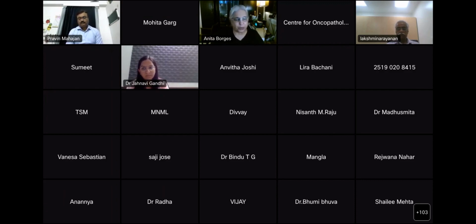Can I just ask Lakshmi Narayan one thing in respect of the same thing? Is formalin pigment bleachable? Say you use potassium permanganate bleach, which will bleach melanin. Will it bleach formalin pigment? Yes, we can. Actually, most of the pigments can be bleached, madam. If you use a strong bleaching agent, you can bleach any pigment, except for carbon. You can't bleach carbon. So that's right.